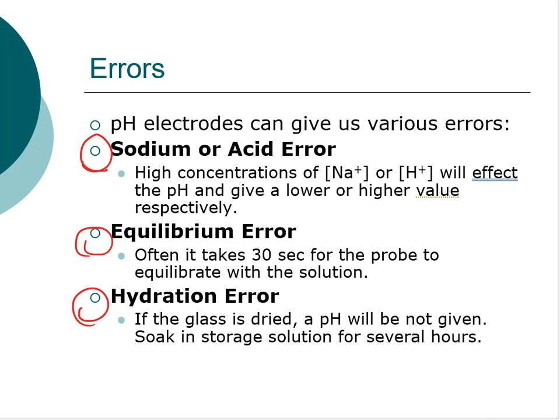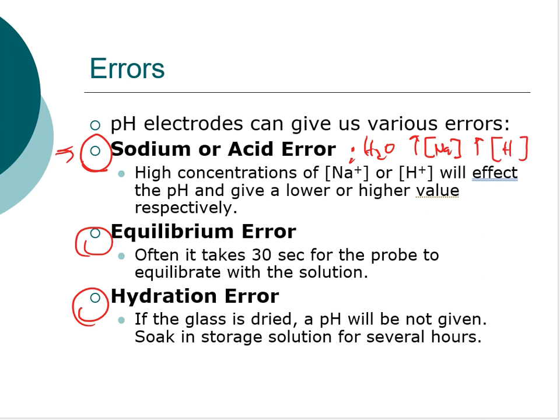Let's start with the sodium and acid error. When using pH probes in a real working laboratory, there will be times we need to obtain the pH of a liquid solution. The problem here is that those aqueous solutions can have very high concentrations of sodium or very high concentrations of hydrogen, and either one of these can cause a problem with the pH probe.